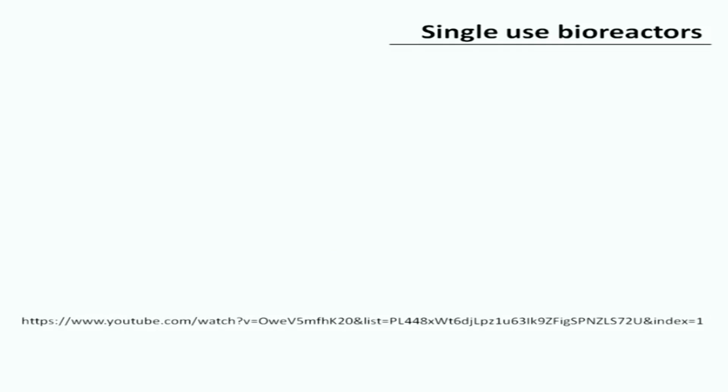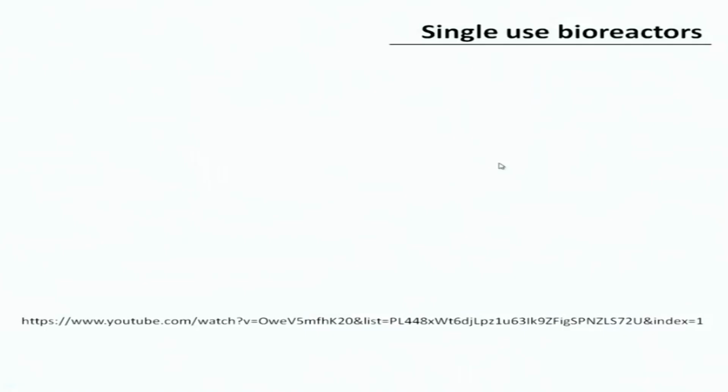What has become popular nowadays in some industrial applications, and also in some lab applications, more so in industrial applications, is the use of single use bioreactors: use it, throw it.